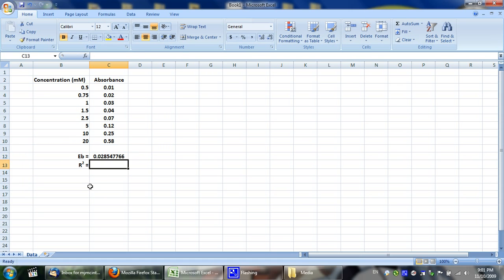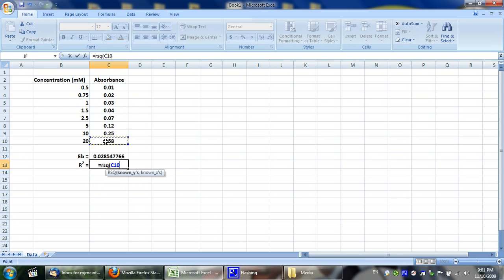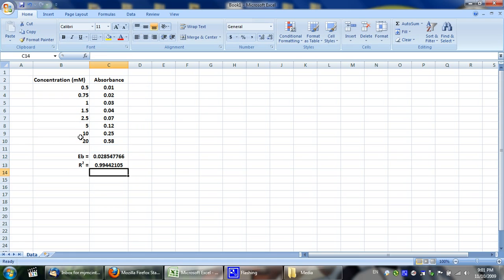That will give you the slope. To test linearity, you use the other formula: equals RSQ for R-squared, open parenthesis, select your Y values, comma, select your X values, and press Enter. A value of 0.99 is a very good linearity coefficient — anything above 0.95 shows a linear trend.